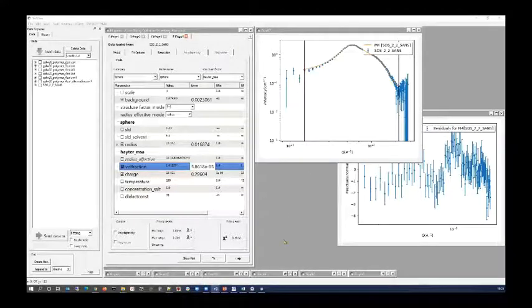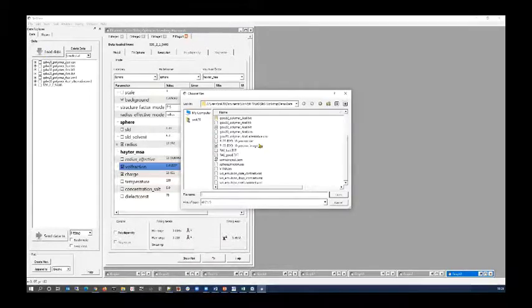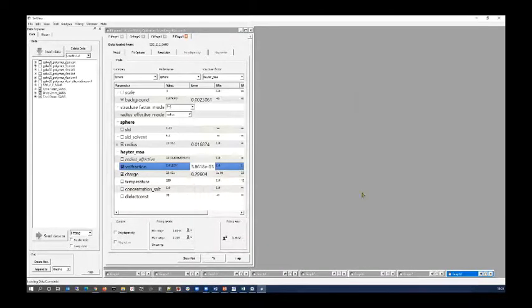All right, so far we've only fitted individual data sets, but there are many occasions where you might have groups of data sets or very many data sets. So let's address that. The example I'm going to do now is from a water in oil microemulsion system. So it's water in cyclohexane. And what we've done is the classic small angle neutron scattering experiment. We've done 3 contrasts, what we've called the core contrast, the drop contrast, and the shell contrast.